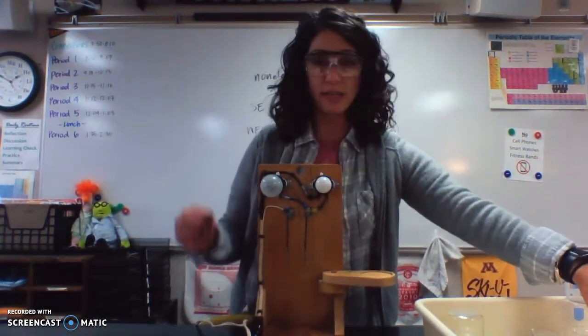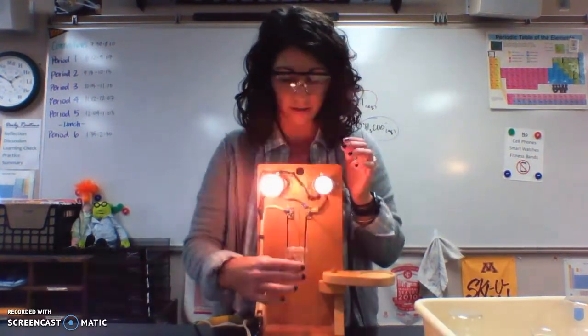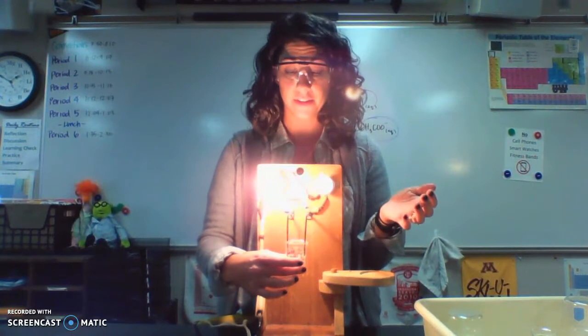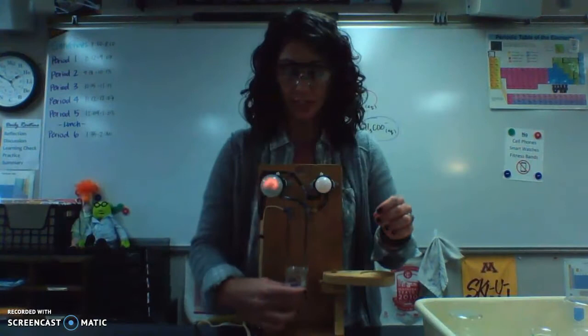All right, let's see if concentration makes a difference. So I have a higher concentration. There is no difference. It dissociates the same regardless. So concentration does not matter.